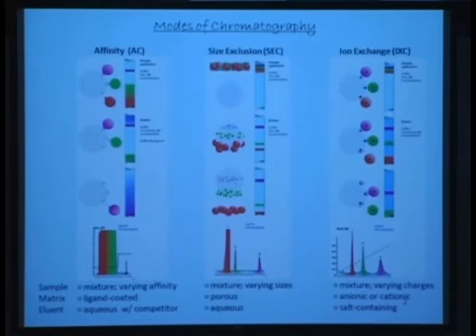So even 2,000 can pass through. Not only that, if you have 1 molar, let's say sodium chloride, in the solution, and if you have, let's say, 100 ml of this particular eluent that you have collected containing your molecule, what is the amount of sodium chloride that is present in 100 ml? 5.8 grams.